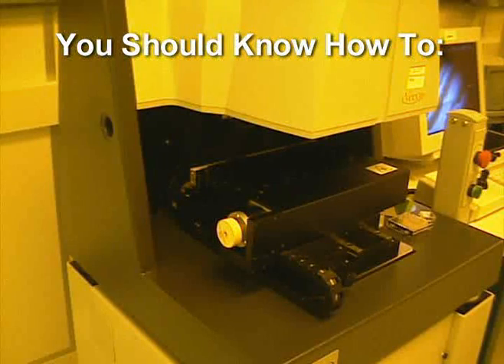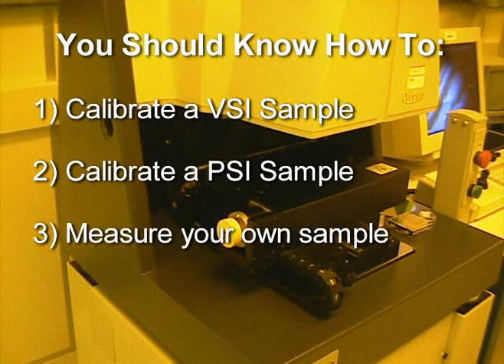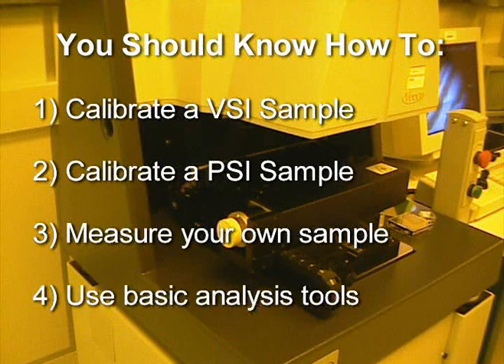After watching this training video, you should have a good understanding of how to calibrate a VSI sample, calibrate a PSI sample, measure your own sample, and use analysis tools.